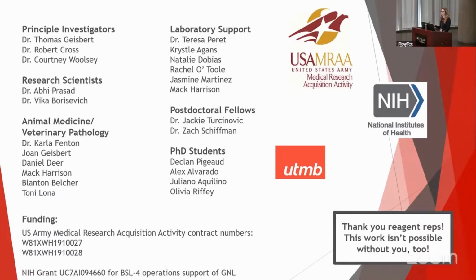It's on Alexa Fluor 488. It's from Santa Cruz, and it's the only one that you can get. I could try to do a custom conjugation for that as well, but it's a little bit more difficult to get that from one vendor to the other, and it's a much more difficult process. We're hopefully going to submit this as an OMIP so that everyone can use it. And I wanted this to be something that people can just order from whoever their vendor is and be able to throw it together.